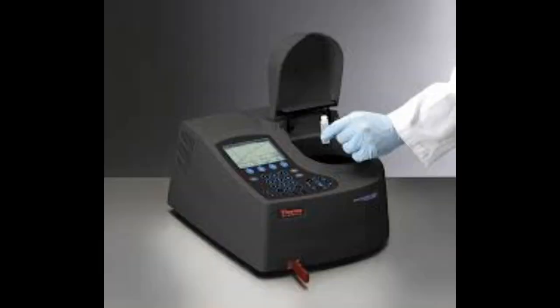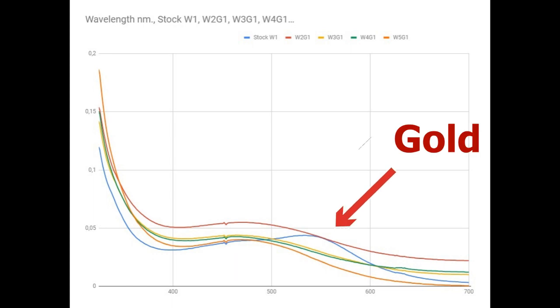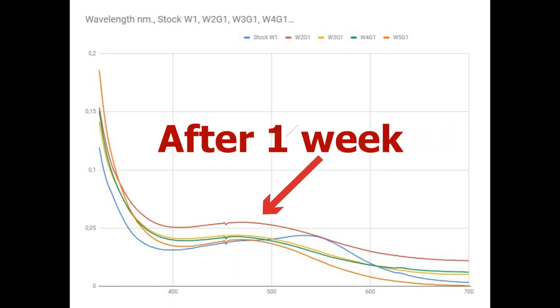We measured the samples we took in a UV-vis spectrometer, and from the absorption spectra it became clear that after 1 week, pretty much all the gold had left the solution.